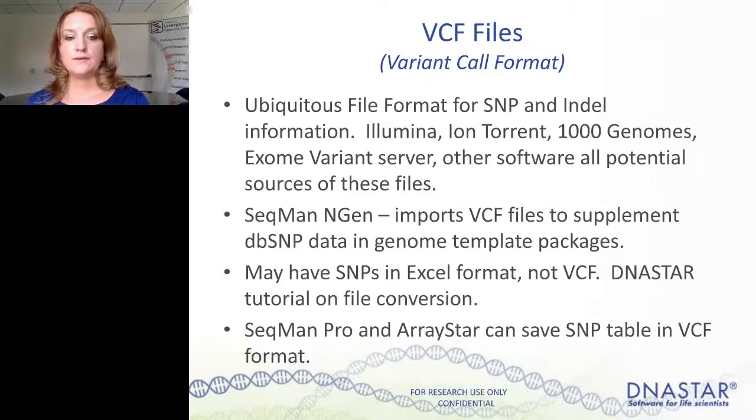You might also have your SNPs in an Excel format and not in VCF. If this is true and you'd like to import them, DNASTAR does have a tutorial that's available, and this can walk you through converting to a VCF file format. Both LaserGene SeqMan Pro and the ArrayStar applications can save their SNP table information in VCF format for export into other applications.